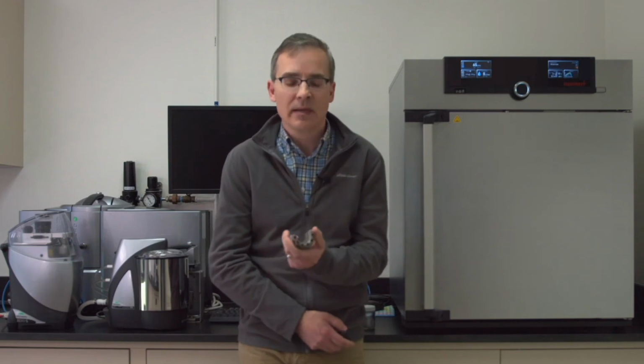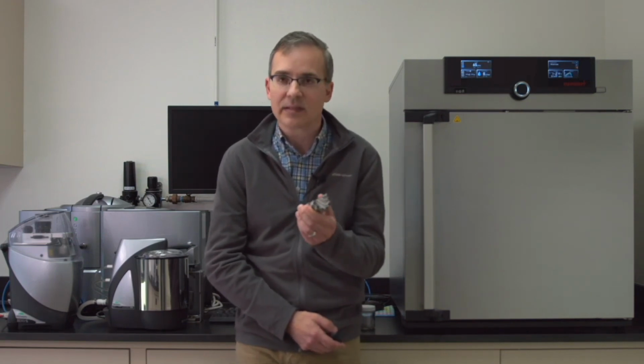So then outside of powder characterization, again, we go back to testing the final printed parts or test specimens. Many times, instead of taking a final printed part and destroying it to measure its properties, the manufacturer will make a sacrificial test specimen, such as a cube or a bar, from which we will then conduct tests. Chemical analysis, very similar, is done with the powders. The only difference being, in this case, there's very careful specimen preparation that occurs, and then moves on to metallurgical evaluations. This is, for the most part, conducted in our metallurgical laboratory, which is just a couple miles from here in Cleveland. And there they'll perform mechanical testing, things like tensile strength, impact resistance, micro hardness of the materials, as well as metallurgical analysis, including optical and electron microscopy, things like failure analysis and root cause evaluations.